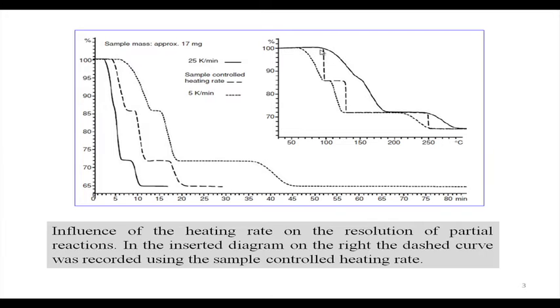So, when it reaches this particular temperature, the heating rate is such that it will be in between, and the heating rate is slowing down, slowing down. So, almost vertical step we can get. Similarly, the second one is also like that, almost vertically down. And also the third one. So, you see how clearly we get this point as the temperature, which is pretty close to 95, the second one is also pretty close to 140, and the third one is also pretty close to 250 degree centigrade.